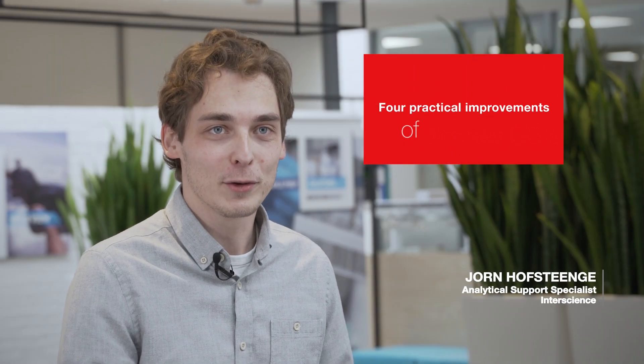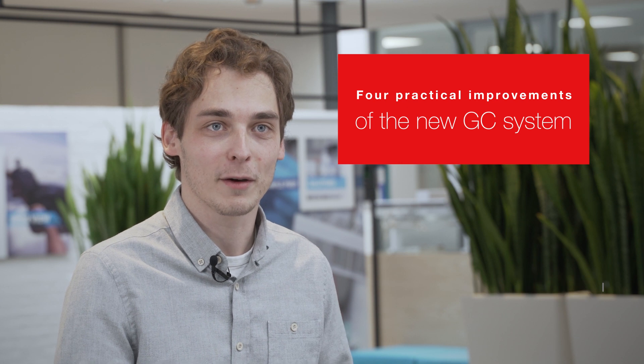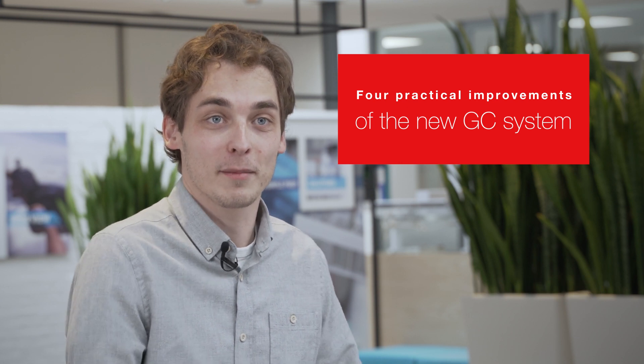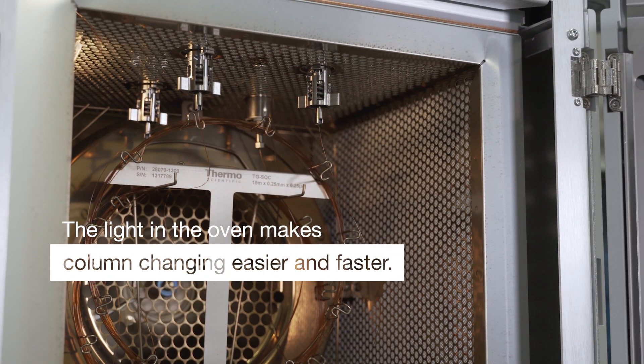Today I want to talk to you about the new GC in our lab. I've been working with this GC for the last couple of months and I would like to tell you what I think is nice about this new instrument. They've improved many things, and one of the nice things they've added is that there's now a light in the GC oven. This may seem like a very small thing, but anyone who has experience with changing GC columns knows how critical it is.